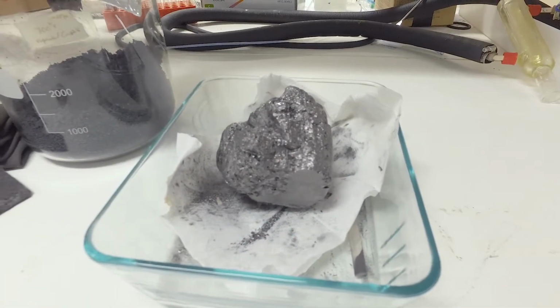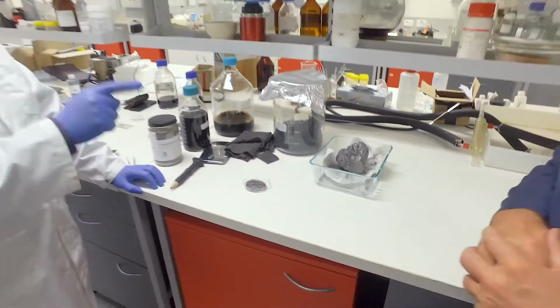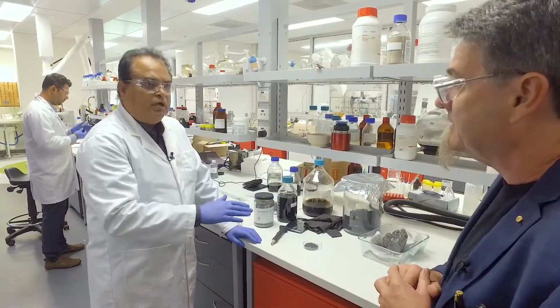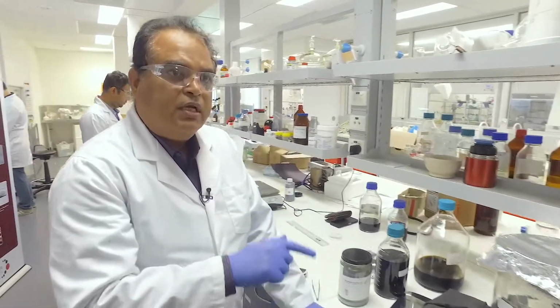And what's the next step? Is it to exfoliate it into different... First to make the flakes out of it, and then intercalate those flakes. So how do we get from here to the flakes? It is just by manual crushing at this stage. We are controlling the mesh by sieve filtration. And then we do the intercalation of this material.